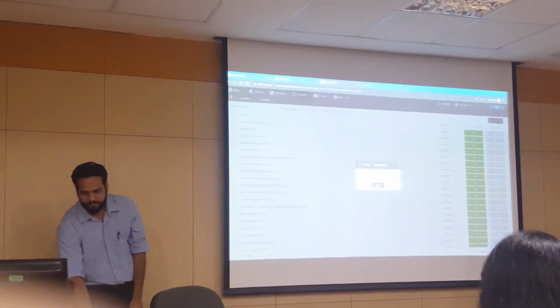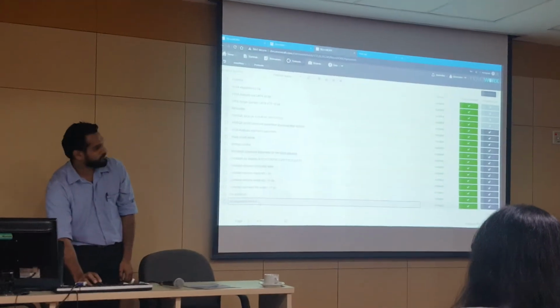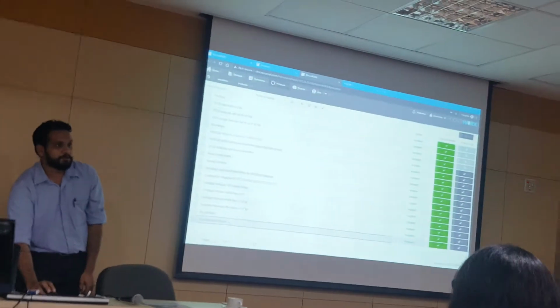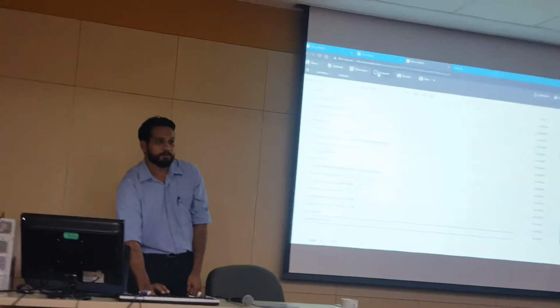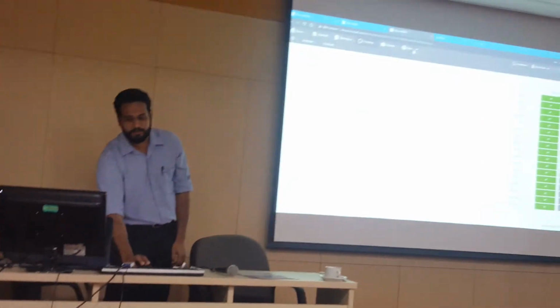And when you save your protocol, it's created as the new protocol here. And this protocol, you can use over and over again for all your projects, for multiple projects. And you can also share this protocol with other users.